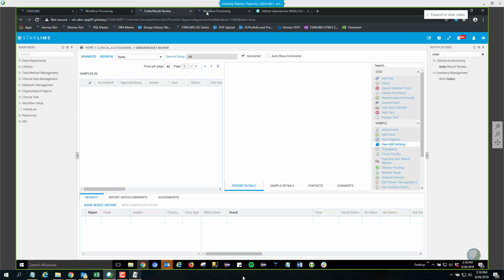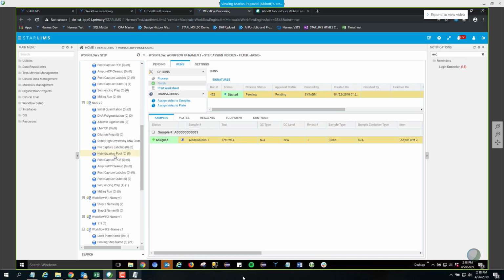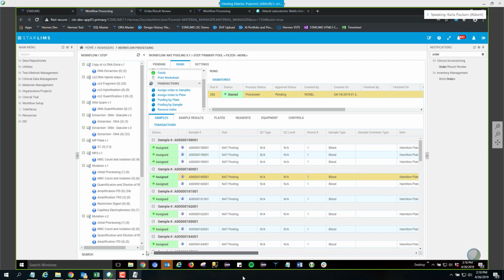Marius, would it be possible to have frozen columns in that grid when you scroll, because there are so many columns that you have to scroll to the right, so we don't lose track of the sample number. Frozen columns, yes, please, because I think that would be good. I would think at least the first four, up to the QC level, that should be fine. Then at least we know what sample we're looking for when you scroll all the way to the right. Thank you.